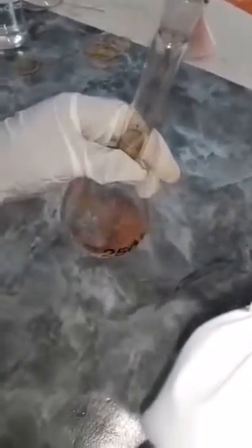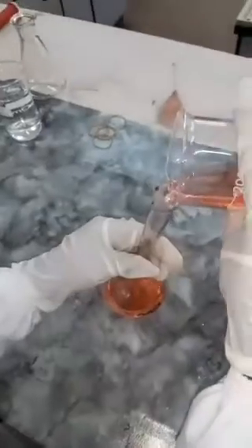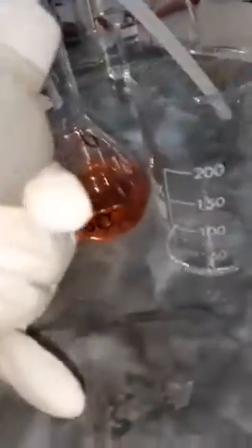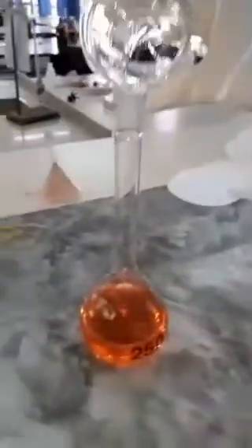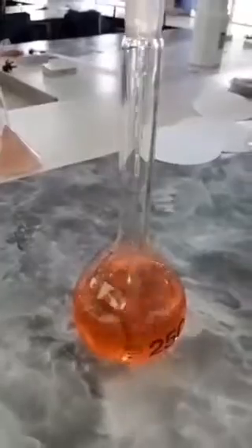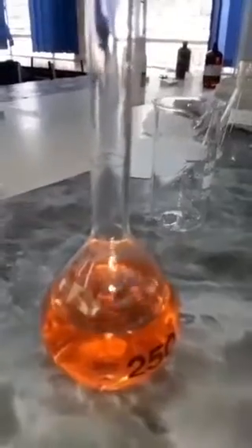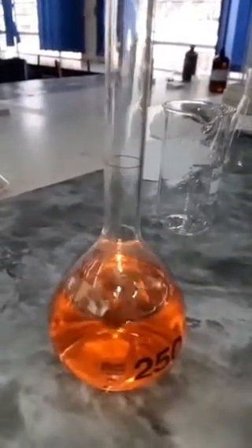Okay, so I get rid of this. And then we'll bring it to the mark using distilled water. So we'll add a bit of distilled water just to transfer the whole filtrate into the 250 mL volumetric flask. So your solution should be clear like this, not cloudy. If it's cloudy, it means the filtration did not take place as it should. So using distilled water, we'll bring it to the mark.